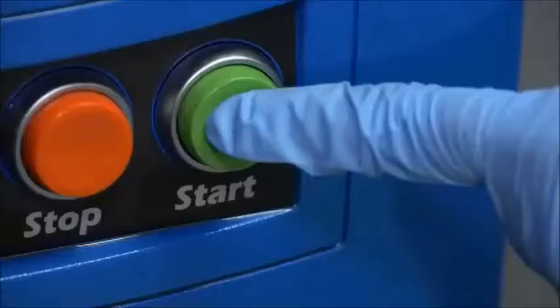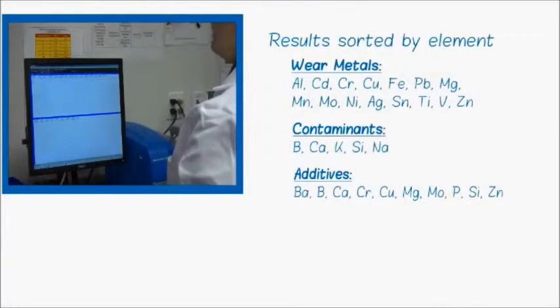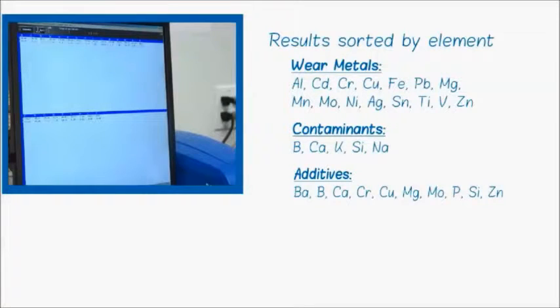To do your burn, you push the green start button. Once the burn is complete, you'll see your results in the software sorted by element. Here what we're looking at is two burns of the same fluid, and this is pretty standard repeatability. The elements which you see on the screen are controlled by which program you're using.